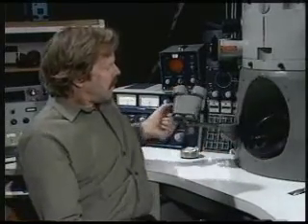Now, I've just been here at the Boulder campus of the University of Colorado, working with this high-voltage electron microscope here, looking at some cells, and every time I look at cells, I'm amazed by their complexity. You know, it's been estimated that each cell has on the order of 10 billion protein molecules in it. That's a lot of molecules for a cell to keep track of. You wonder how the cell can possibly maintain order when everything tends toward disorder.